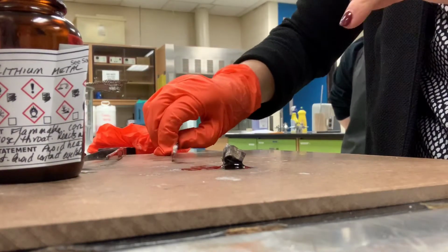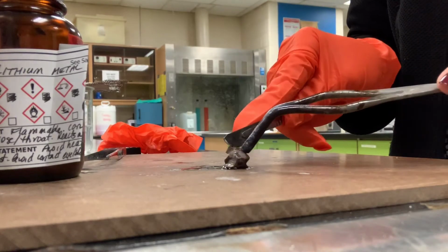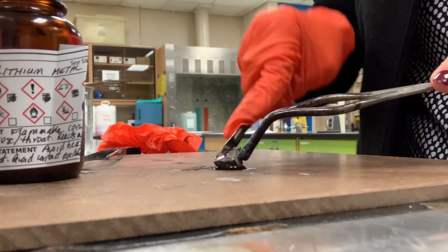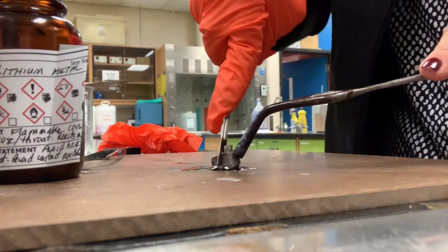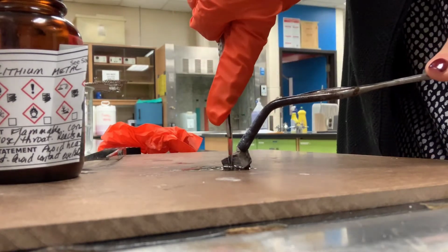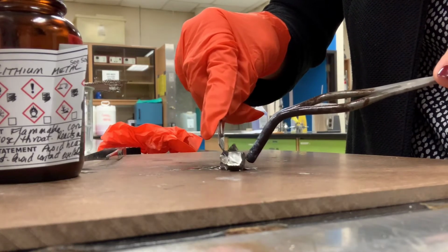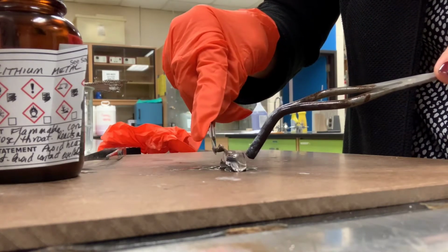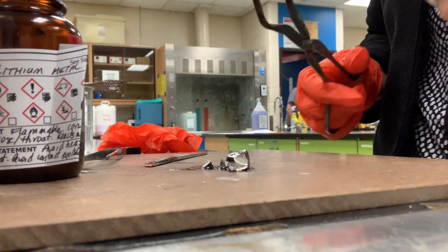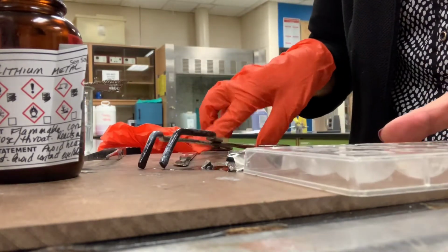Okay, here's a piece of lithium. We're going to cut that as well. We're going to see that this lithium is a bit harder than the sodium to cut. It's also kept in the mineral oil, but you can see that it is quite silver and lustrous, all the properties of a metal. Then we will also put that into our spot plate for our next reaction.